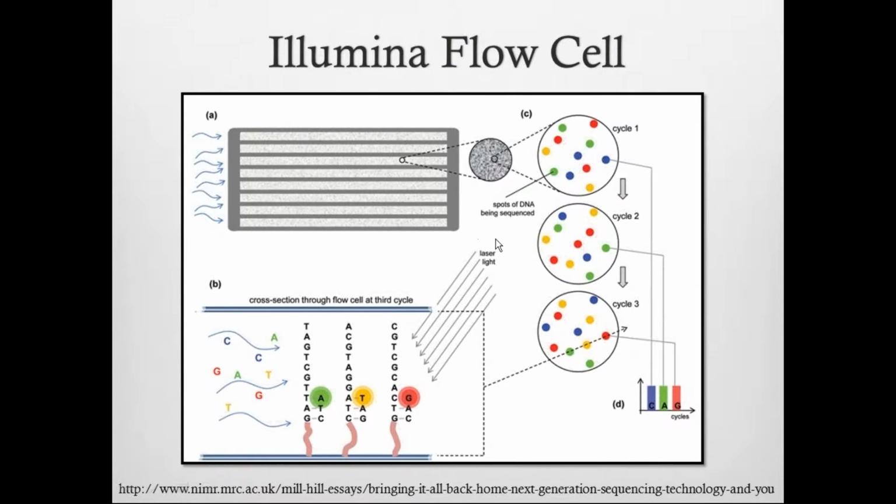But you can still only sequence 96 samples at one time. That is, you can only sequence 96 individual strands of DNA, and at most get, again, maybe 500, maybe a few hundred more bases, but that's about it. So 500 bases times about 100 capillaries. So that only gives you a very limited amount of sequence information that you can generate.